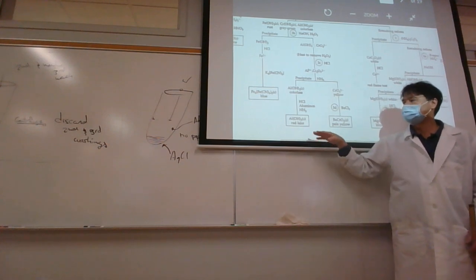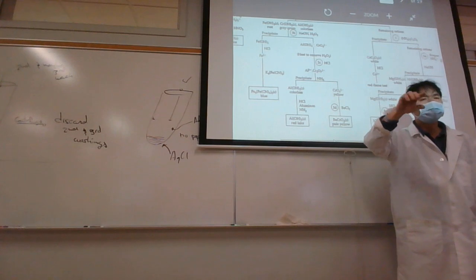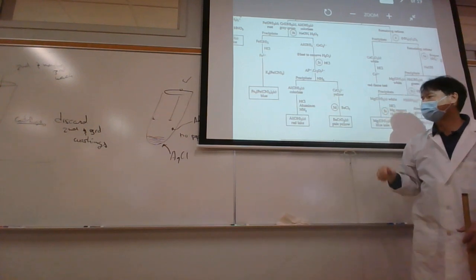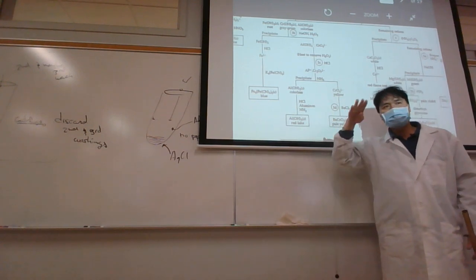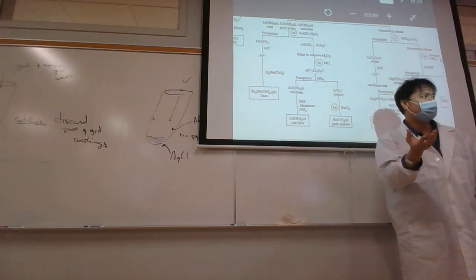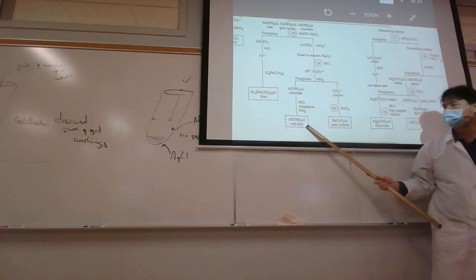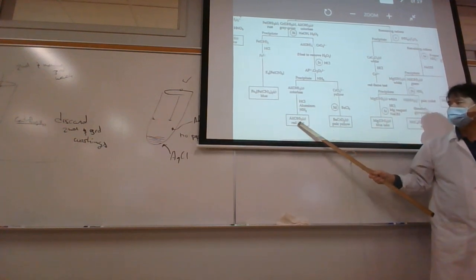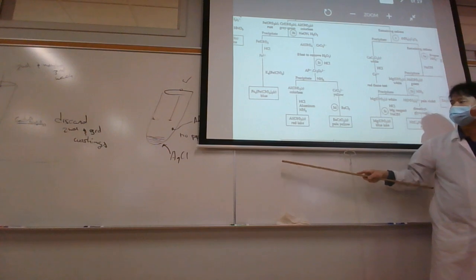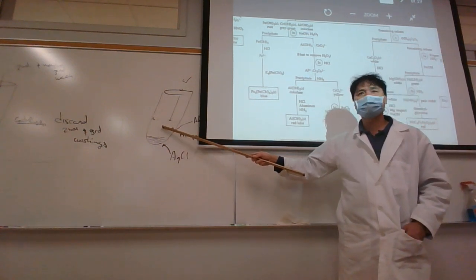And the red Jello, we're going to centrifuge, and that's going to compact the Jello on the bottom. And when we look at it, it looks like a red lake stuck at the bottom of the test tube. That's what it is going to look like. This is what they call the red lake test, because we generate this red Jello, which when centrifuged forms a little lake at the bottom of the test tube, and then you have this clear solution above it.